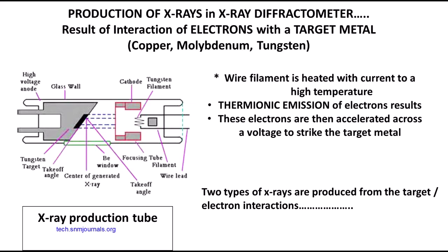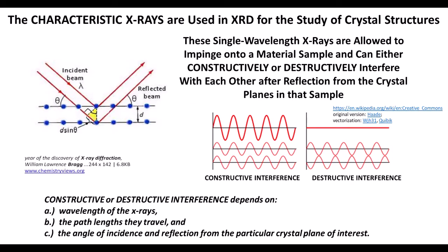At this point, the X-ray beam is going to travel towards the sample and interact with the sample. And if the X-rays undergo strong diffraction with the sample, then an X-ray beam will be detected by an X-ray detector located in the forward scattering direction.